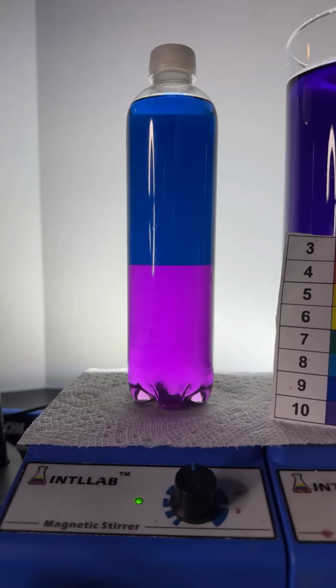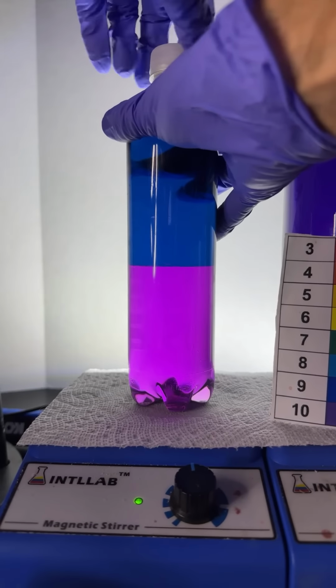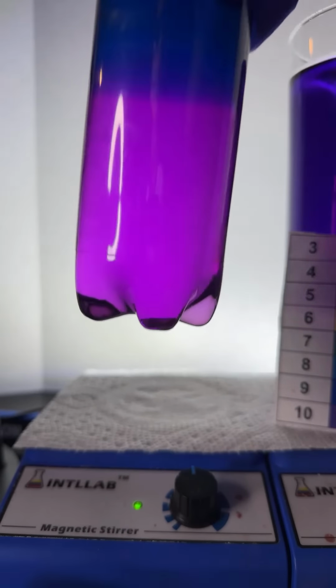Here, let's make it go reverse. I'm going to start adding some acid to this. We're going to watch what happens. It's not hot, Xenon. Interesting. So you're seeing more salt crash out when, well, I'm not seeing much salt, to be honest with you.